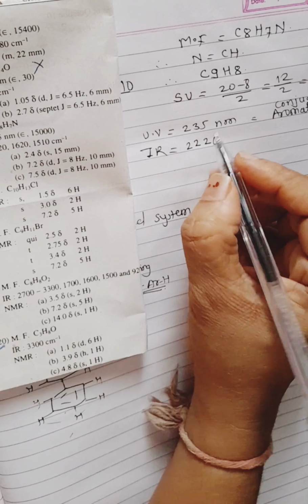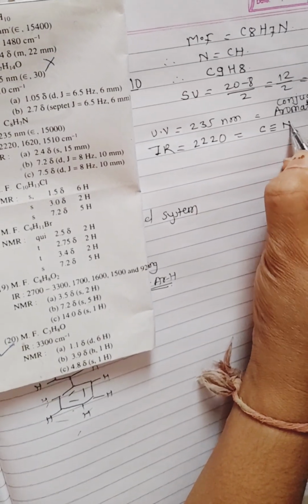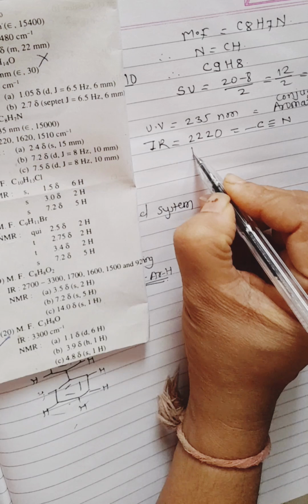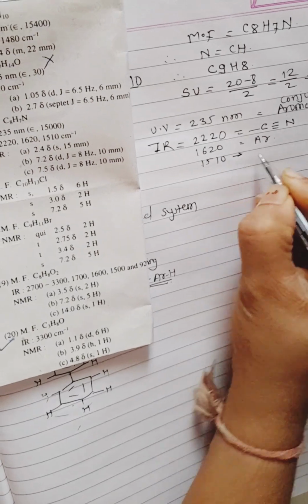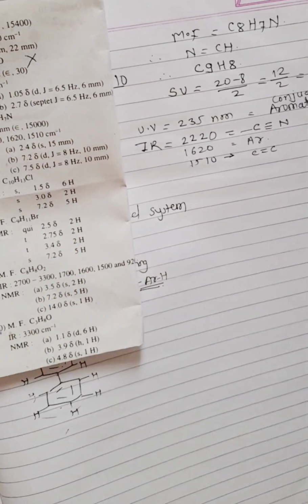This indicates that there is a clear-cut C triple bond N group. This frequency is very specific for cyanide. Then 1620 for the aromatic ring and 1510 for the C double bond C and CH stretching, isn't it?